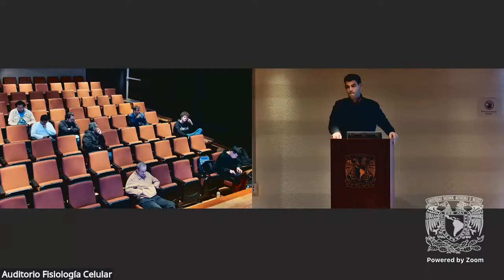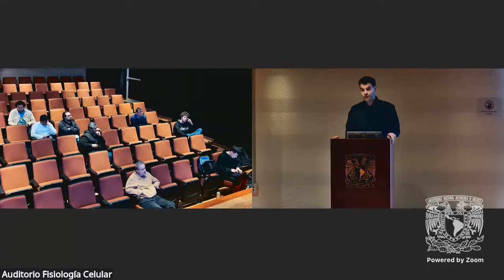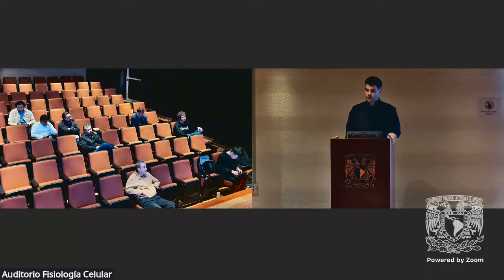So are you talking about files that are locally on your computer? Then you just wouldn't do the streaming thing. No, I know. It's not streaming, but right. But you would really have to write your own code, or do a for loop over all of the files, read in the data that you want to read in. We want to provide automated analysis tools, but to be honest with you, once you get into aggregating over multiple sessions, it becomes very custom and very experiment specific. So it's really hard to build tools that aggregate over multiple.